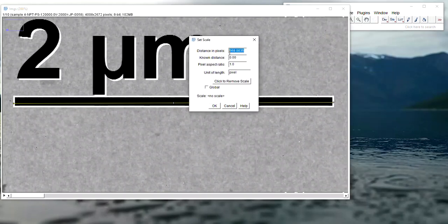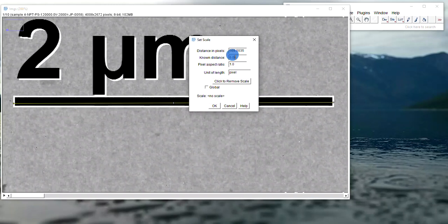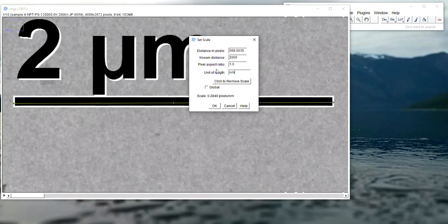You can tell it that this many pixels is equal to 2 or 2000. Let's work in thousands to have more details. The unit is 2,000 nanometers, and you want to click on Global to set this onto all of the images.